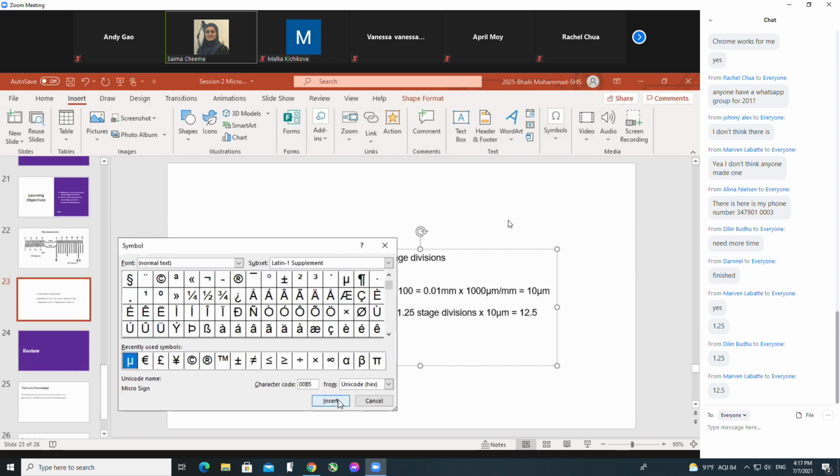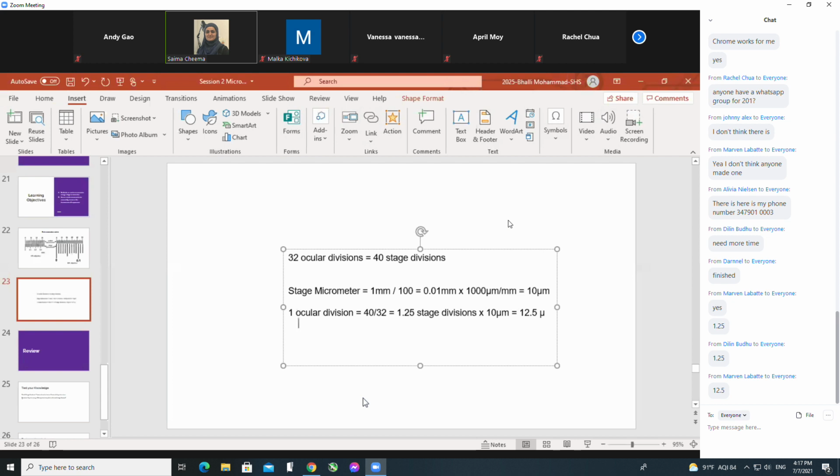You get it? So now our ruler is calibrated.